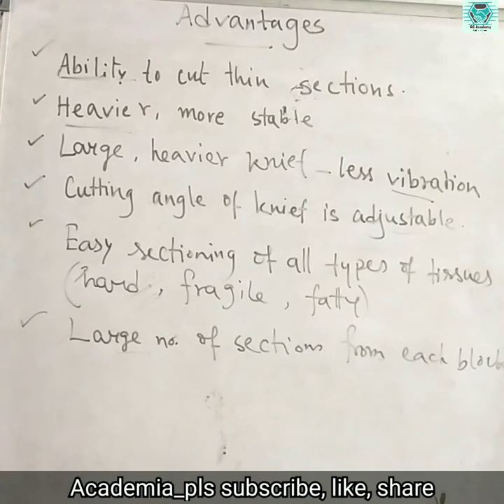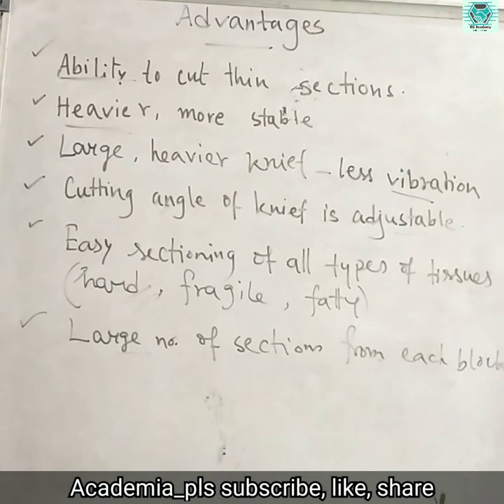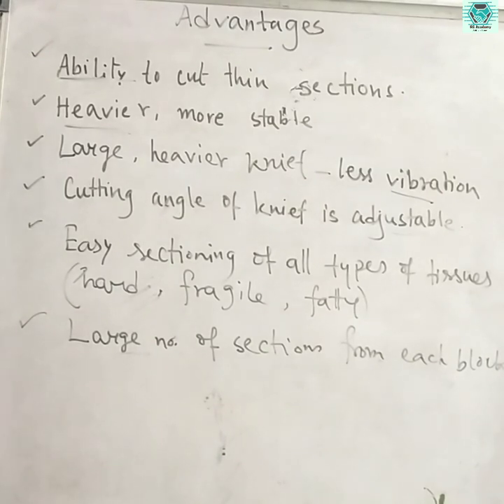Otherwise the rotary microtome is the ideal microtome for the practical experiments on histology specimens, and after that we can go for the staining process to see the different types of microscopic specimens. So this is all about the rotary microtome.